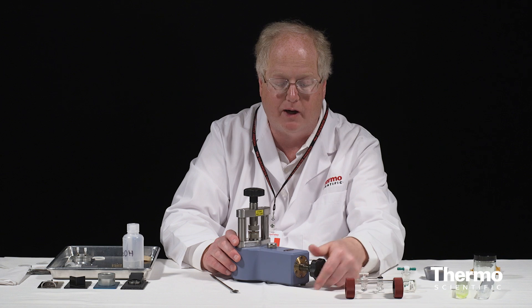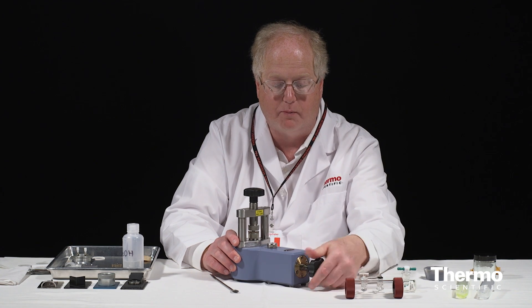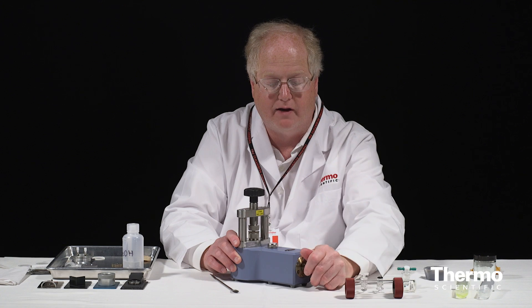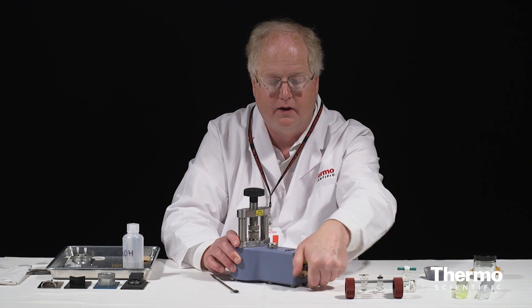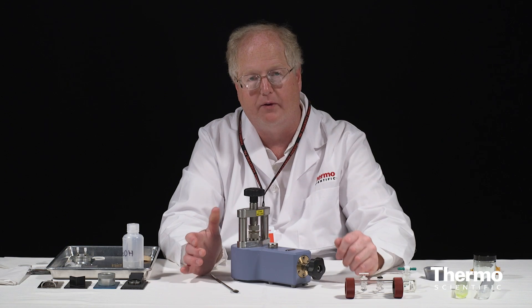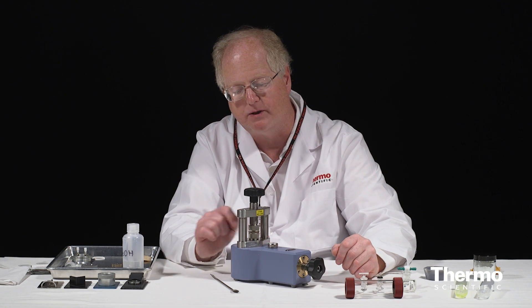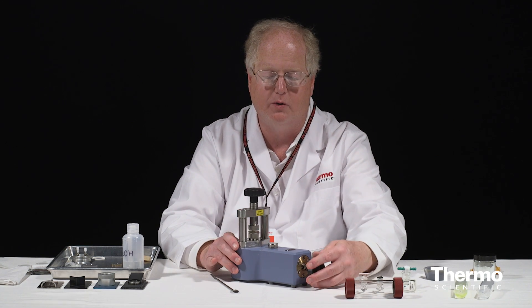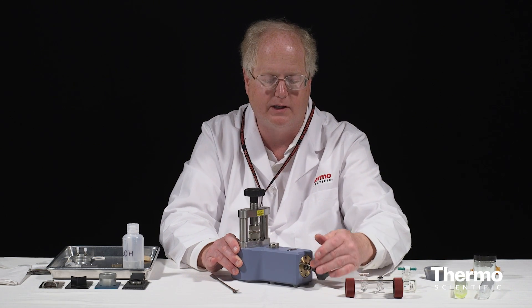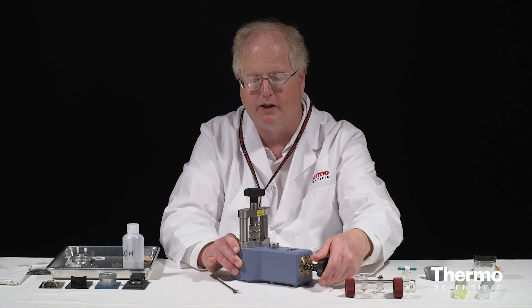Then I will rotate my pellet press, applying the pressure. You can see the pressure gauge going up. I've now got a ton of pressure, a ton and a half — and that's probably enough; it's right around a ton and a half. At this point the gap is still there. My sample is located at the base of that anvil. So now we will release the pressure and have a look at the pellet.